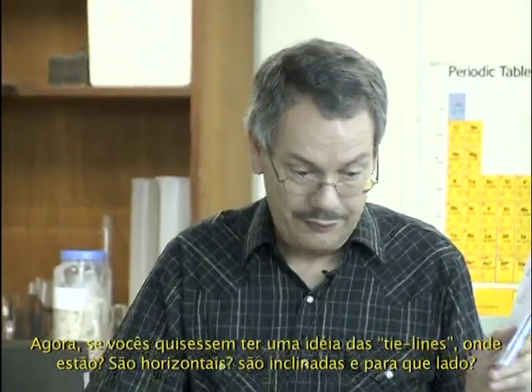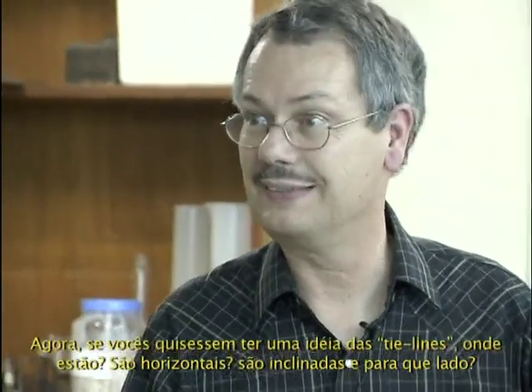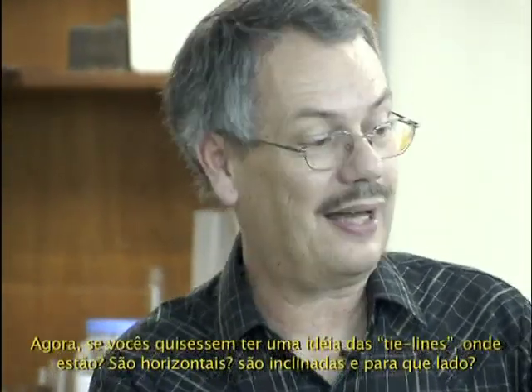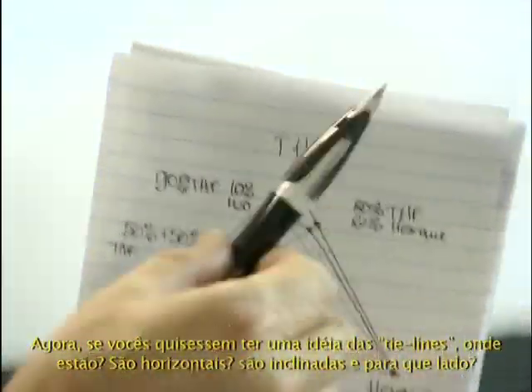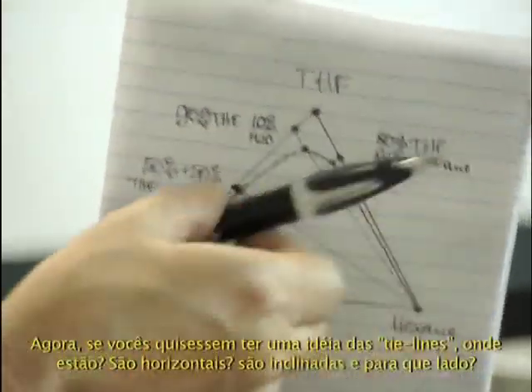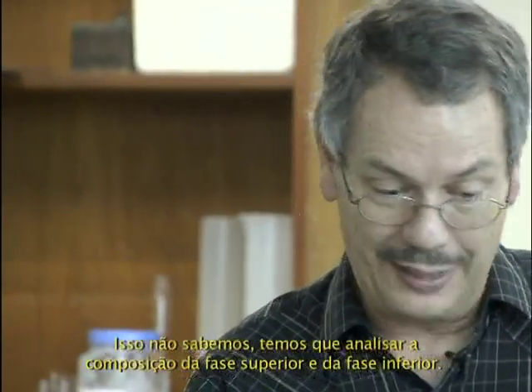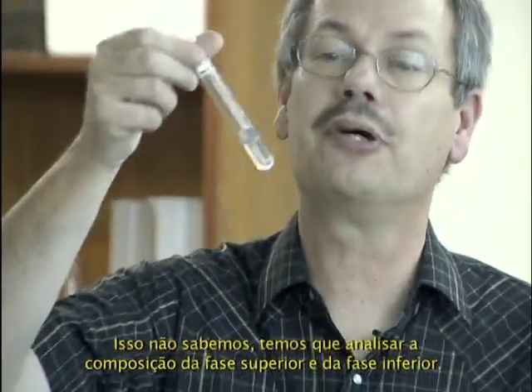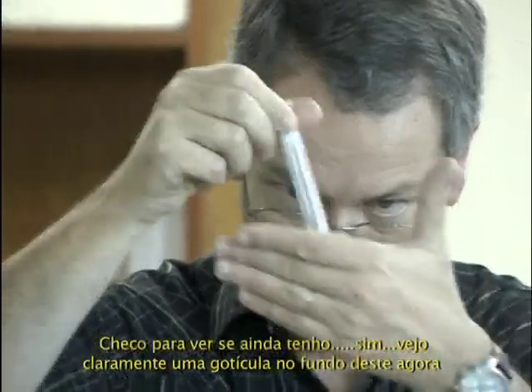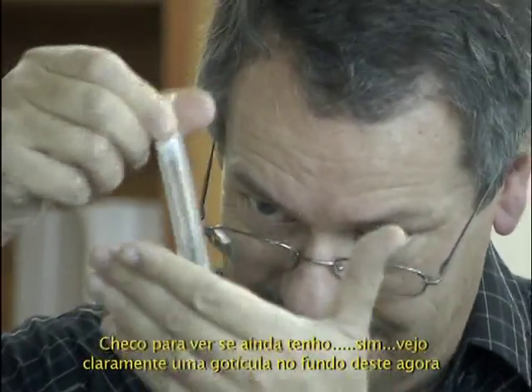Now, if you would like to have an idea of the tie lines, where are the tie lines? Are they horizontal? Are they sideways? Which way? This way? This way? You don't know. You have to analyze the composition of the top phase and bottom phase. I check that I still have, yeah, I clearly have a droplet at the bottom on that one now.